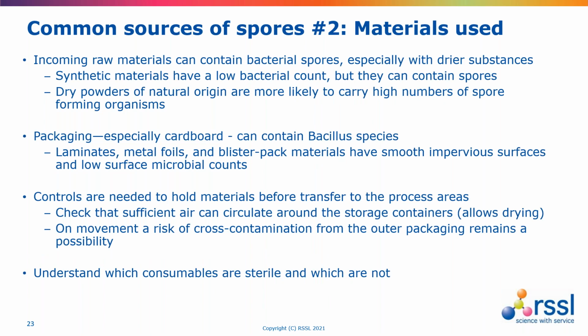With raw materials, it's possible to divide them into different categories, and generally drier substances are at risk from spores.